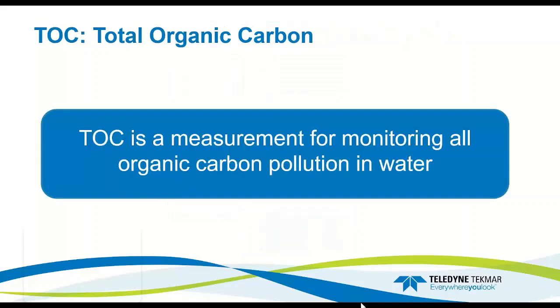So once again, in recap, total organic carbon is a measurement for monitoring all organic carbon pollutants in water. So it's really a catch-all for carbon. We're not looking at specific compounds or specific analytes. We're looking at carbon as a whole. How much carbon is present in our samples?